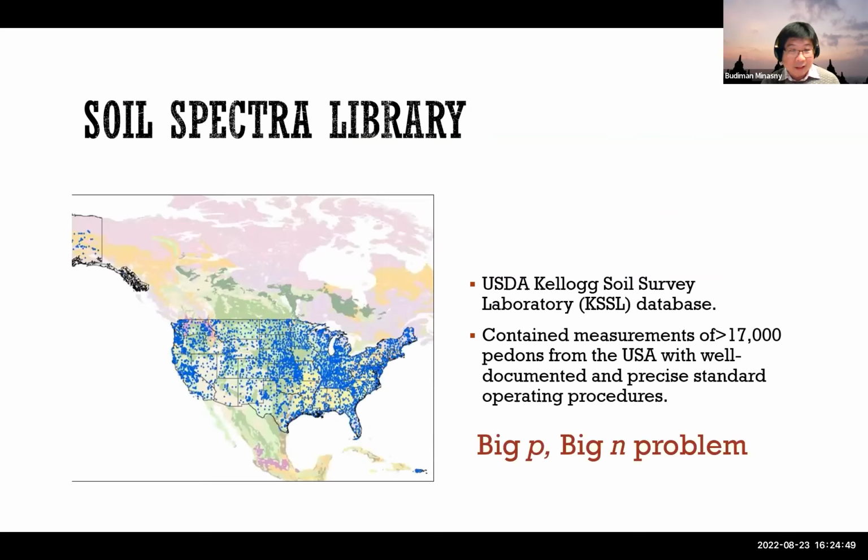Okay. So moving forwards, now we have what we call soil spectral libraries. That means that people in the lab usually kept their soil samples, and with this technology, they go back to their soil library. So people not only keep books in their library, they also keep soil samples in their library and rescan those samples. And with that, we have what we call a soil spectral library.